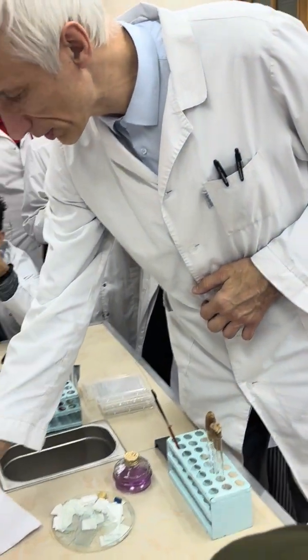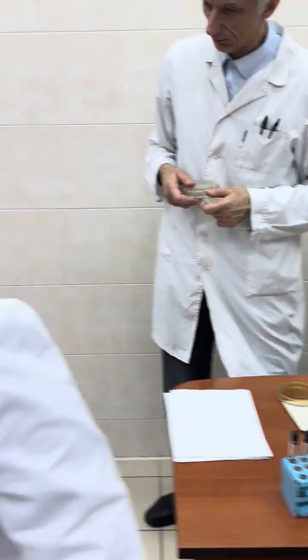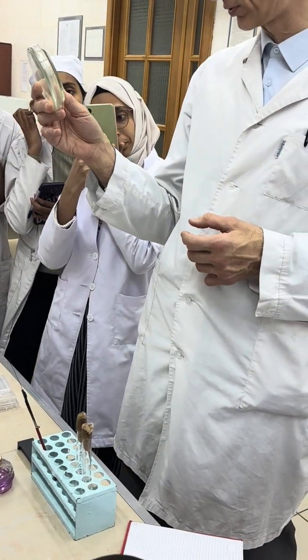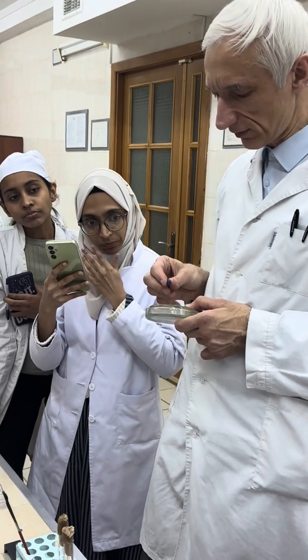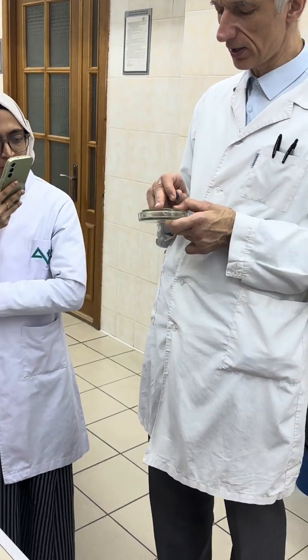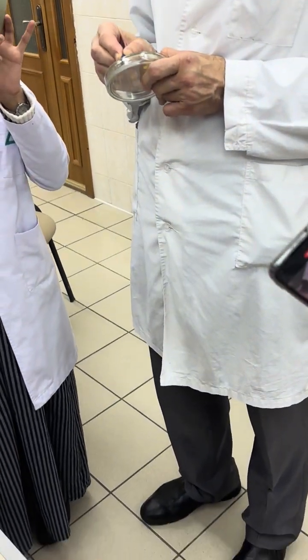Very similar to it will be point number 3, smear from isolated colony, fuchsin stain. You will be provided with a Petri dish. By the way, this Petri dish was already many times exposed to the air. It's visible, a lot of extra colonies of foreign origin appeared. Your task will be, as it is model slide making, so I recommend you not to choose colonies selected by me. I choose a colony that looks larger than the others. So choose the colony.